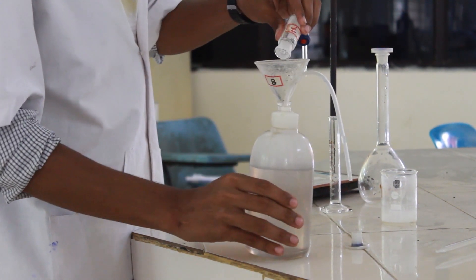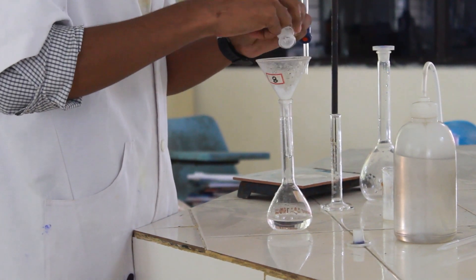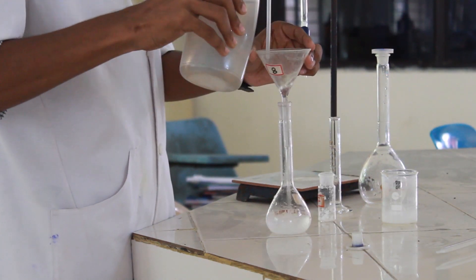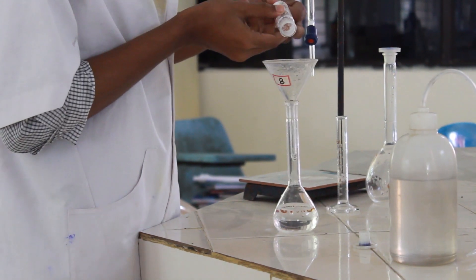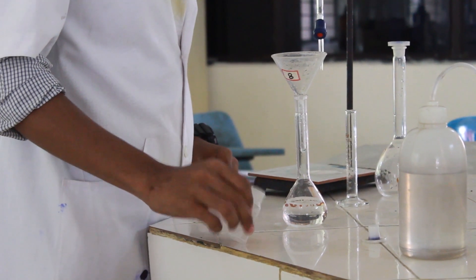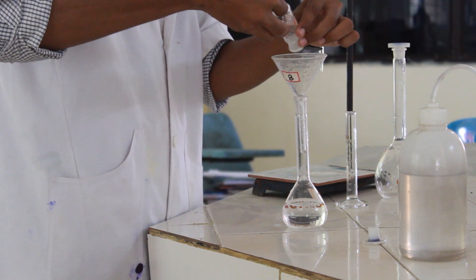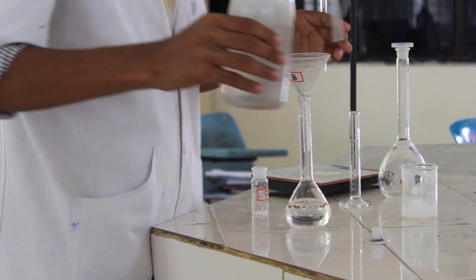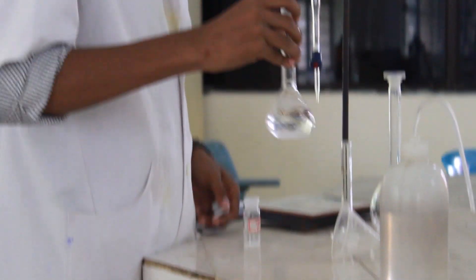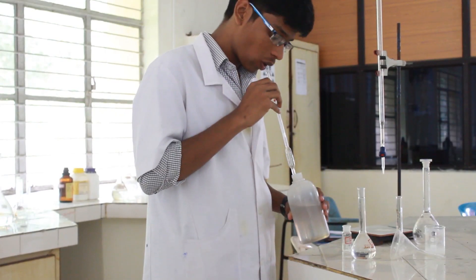An accurately weighed quantity of oxalic acid is transferred into a 100 ml volumetric flask. Adding a minimum quantity of water, dissolve the substance and transfer it completely from the weighing bottle into the volumetric flask through the funnel. Add some more water and dissolve the substance, swirling the flask so that all the substance gets completely dissolved.